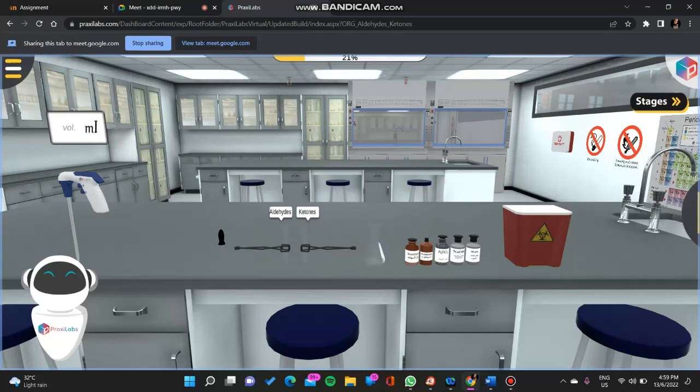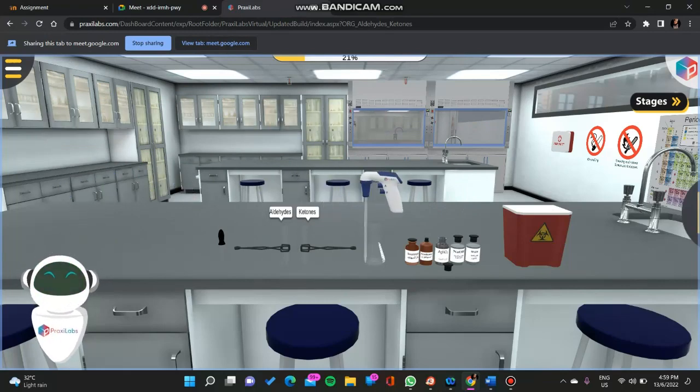So first of all, we need 10 ml of silver nitrate into here.